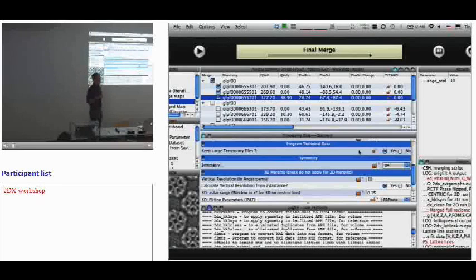They can be amplitude and phases. They are opened as a text file. They can be MTZ files, and if you double-click them, we transform them into an ASCII file, which is displayed then as a text to you. So you can also directly look at MTZ files and PostScript files and 3D volumes and so on. 3D volumes are opened with Chimera by default.